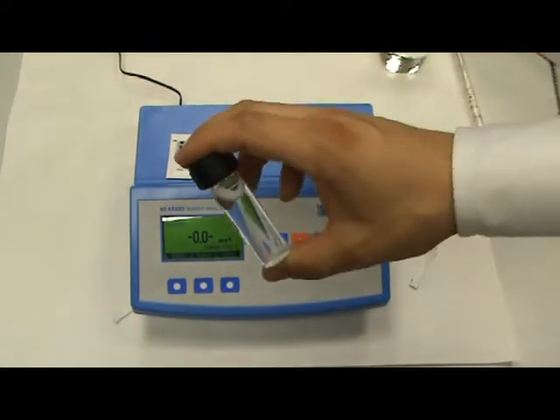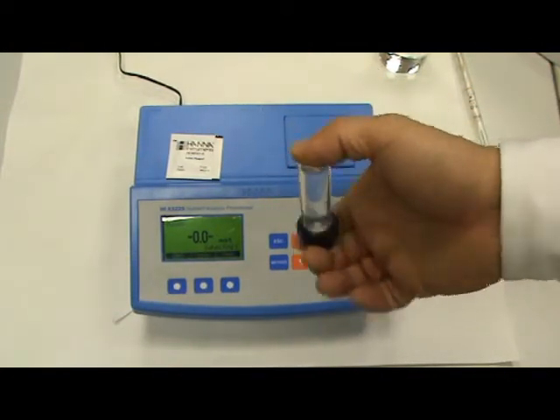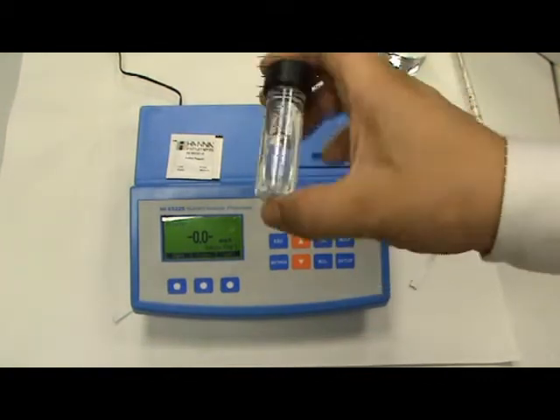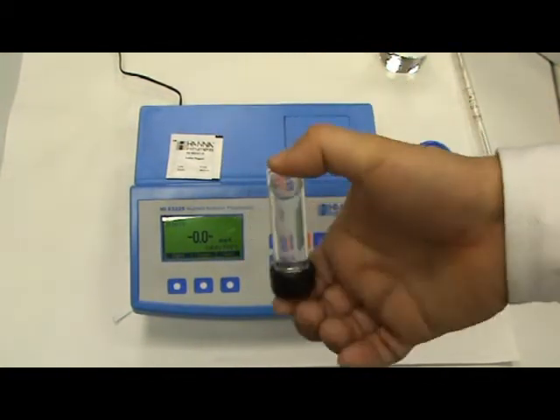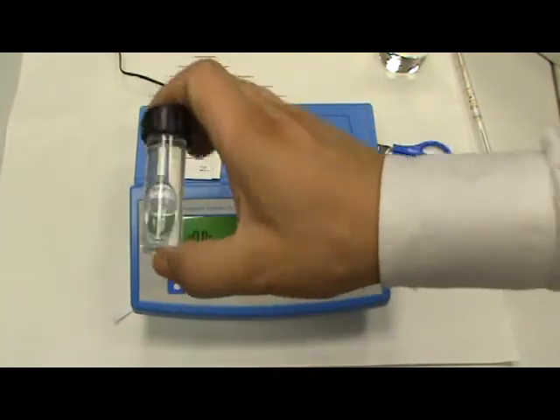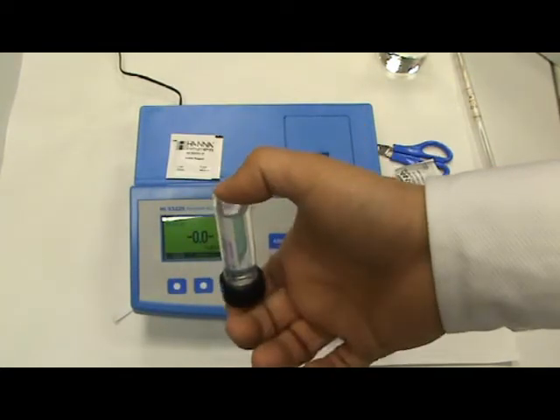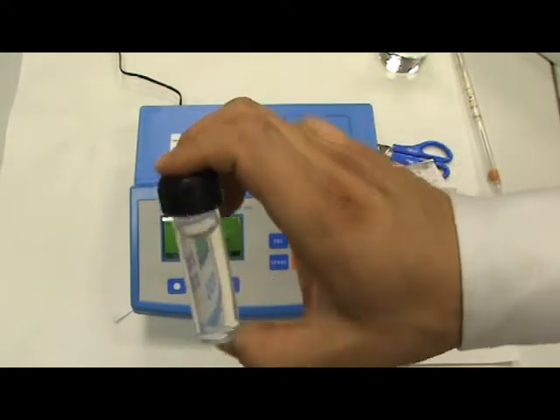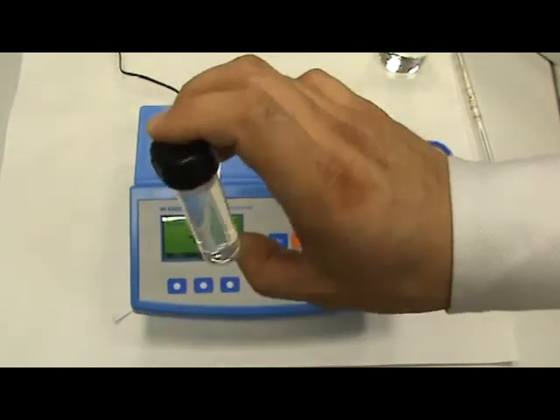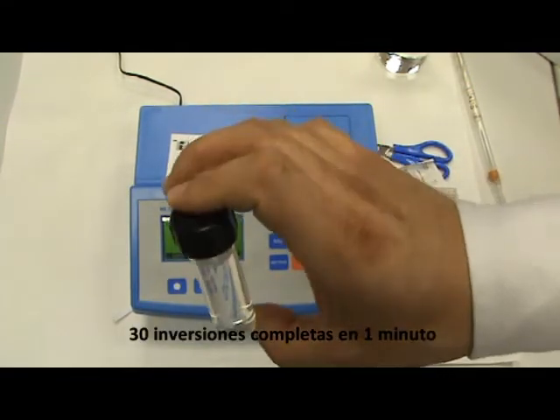Ahora, durante aproximadamente un minuto, vamos a ir invirtiendo despacito unas 30 veces: 1, 2, 3, 4, 5, 6, 7, 8, 9, 10, 11, 12, 13, 14, 15, 16, 17, 18, 19, 20, 21, 22, 23, 24, 25, 26, 27, 28, 29, 30.